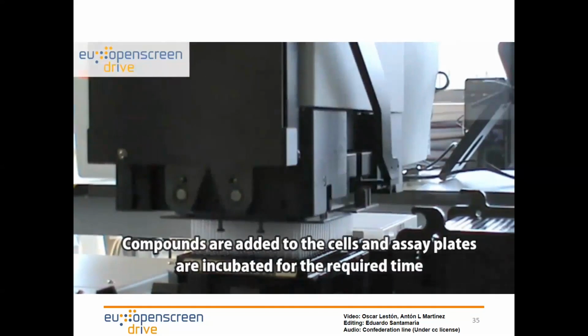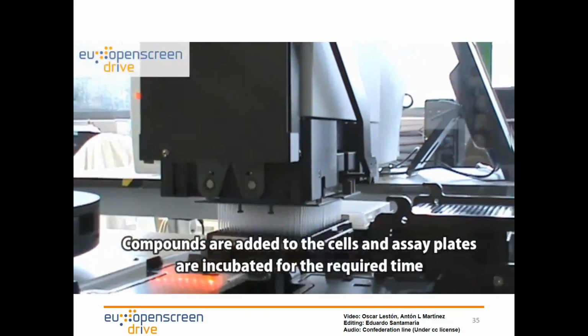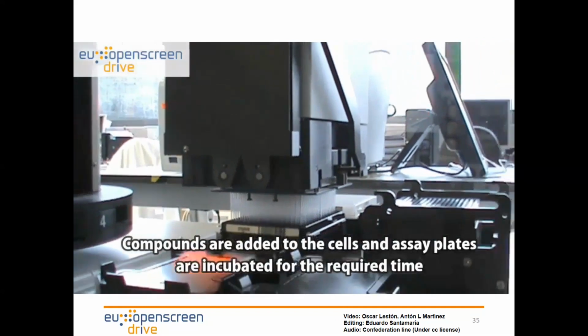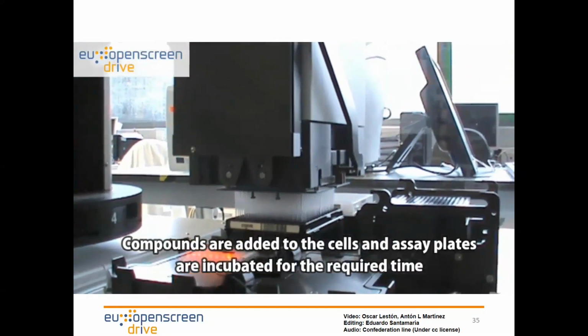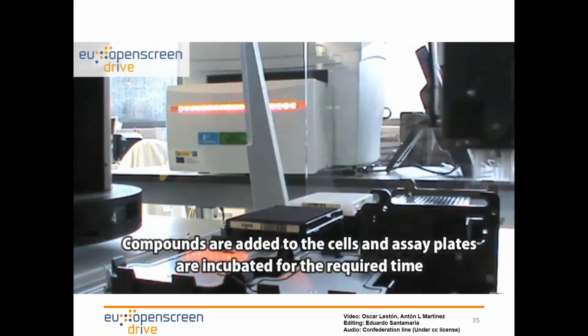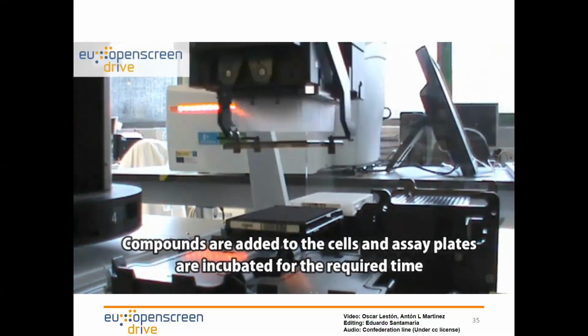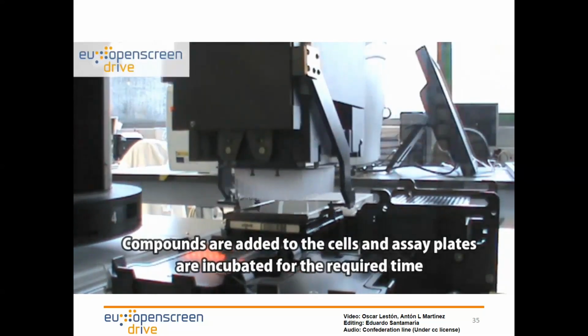As you may see, all the plates are barcode labeled, so that the system is able to follow the process for each of the plates in this assay, and at the end, all the readout that you are obtaining at the reader is classified according to this barcode.